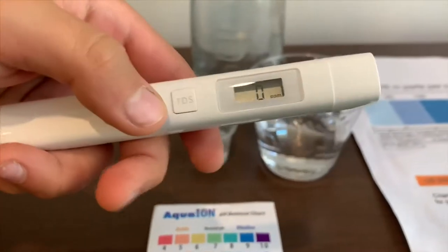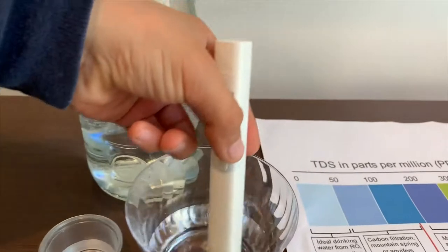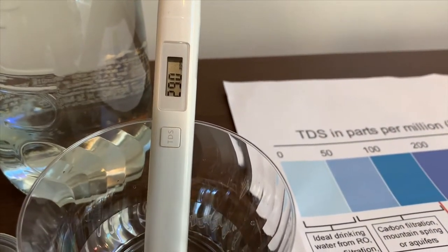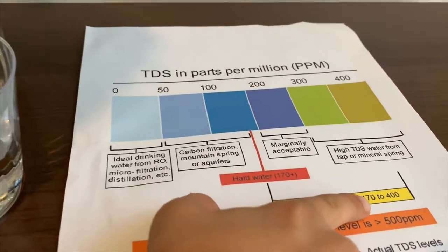Turn on the TDS tester, make sure it says 0, and let's put it in. That is 290 — that is average tap water.